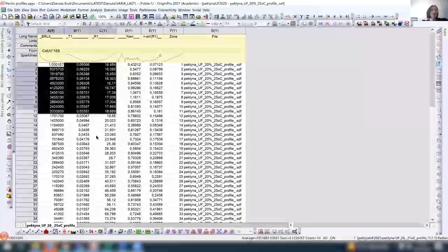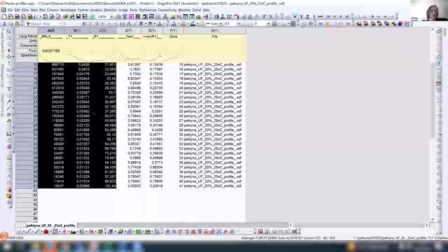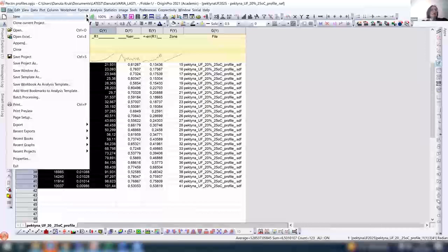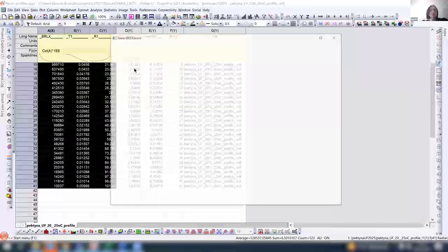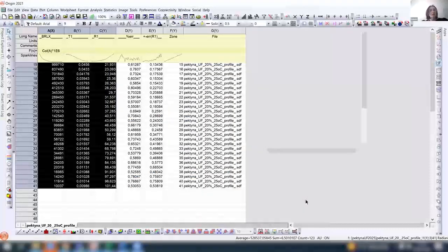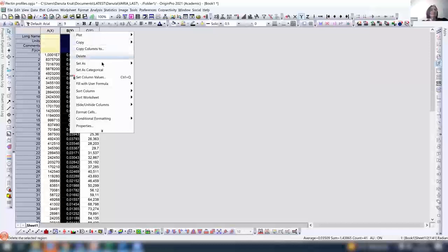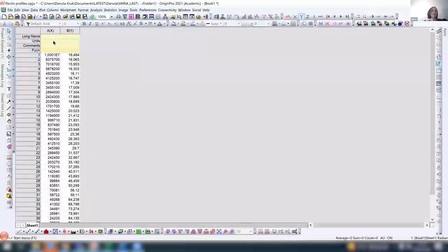And I will copy it to a separate workbook. I'm using Origin actually here. I will remove this thing. And here I have the resonance frequency. Here I have relaxation rate. So let me see the first test, whether maybe I observe translation diffusion, and whether the translation diffusion is isotropic.